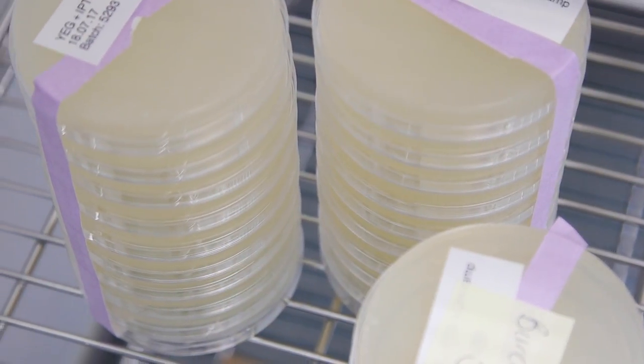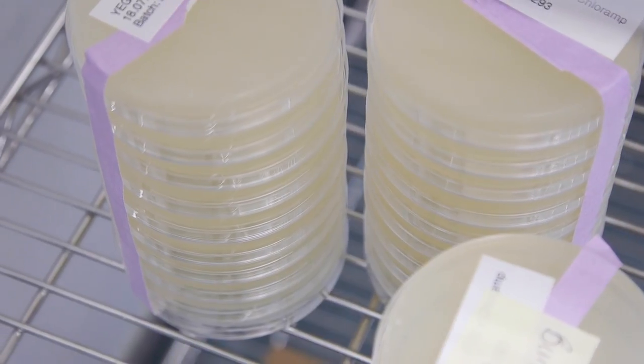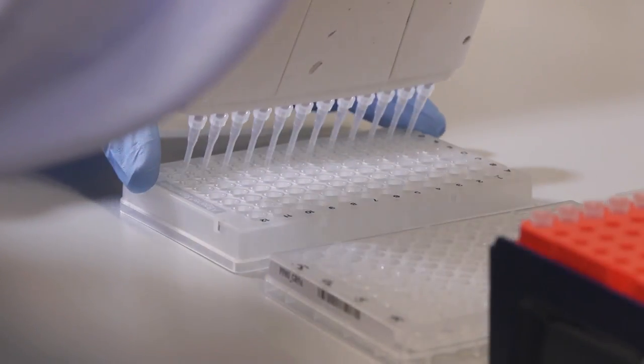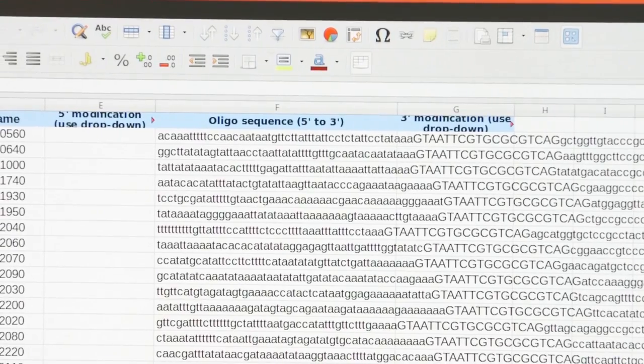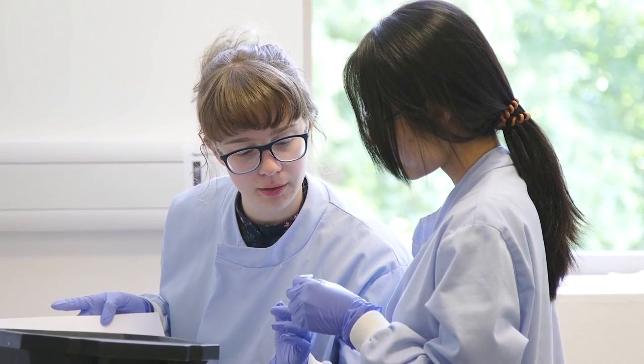Working at scale is very different from performing a few individual reactions in the lab, even at the relatively modest scale of the small malaria genome. Procedures need to be highly optimized and standardized and you need to think about tracking the process through the lab.